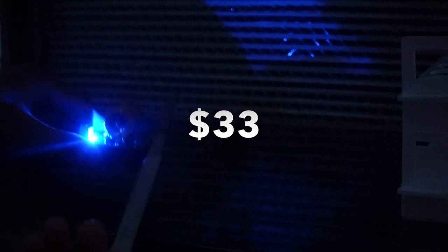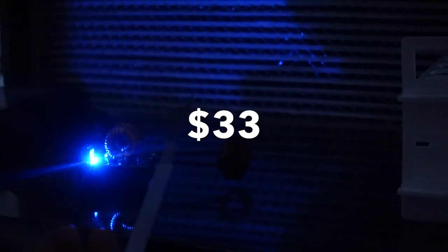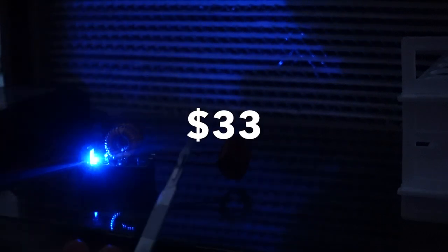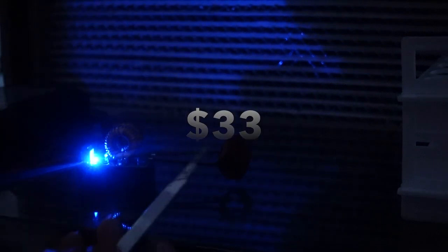So you can make your own induction sterilizer coil for around $33 total. Sorry Michael Geeky, I saw you had one you were selling for like $200. It's cool, it looks very cool, but you can make it yourself.